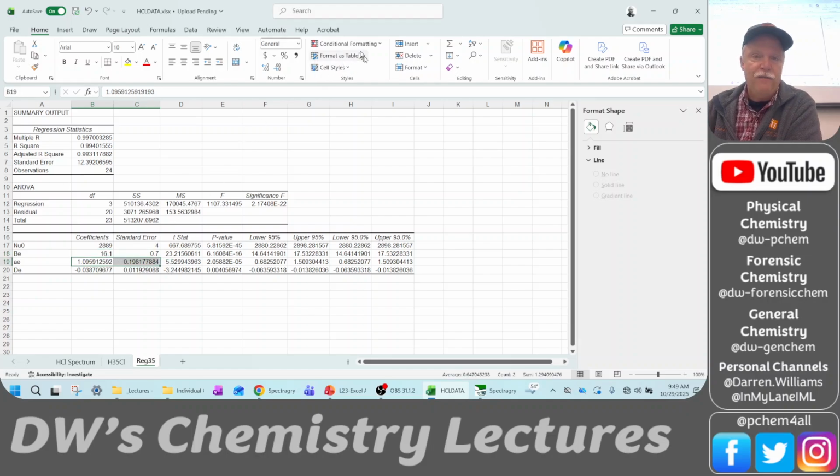Look at our alpha E. So this is really good that we had this glitch. Okay, so that would be our alpha E value, and this would be our DE value. And our DE value is not statistically significant. This P value, well, it is, but it's not as great as the other ones. Okay.